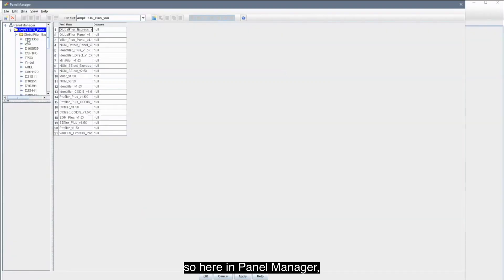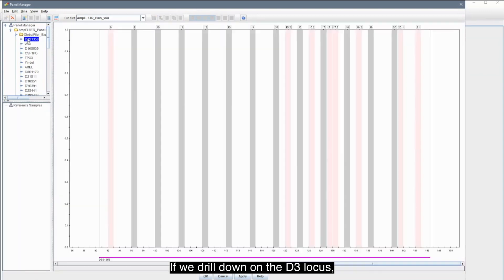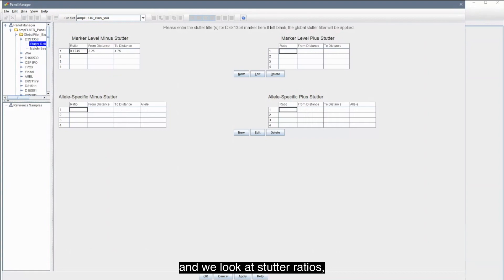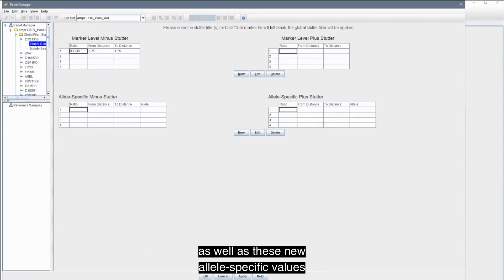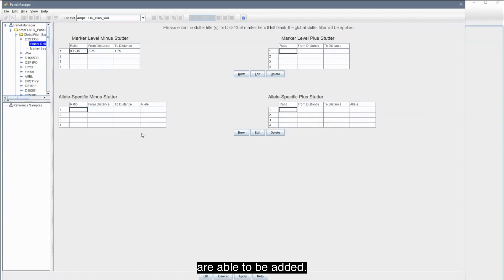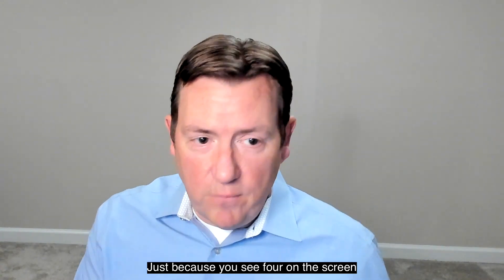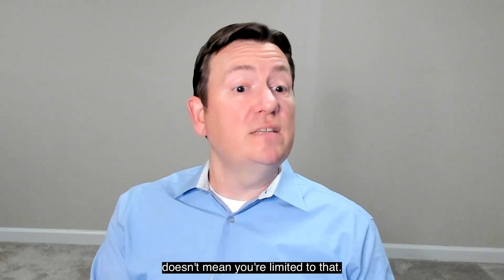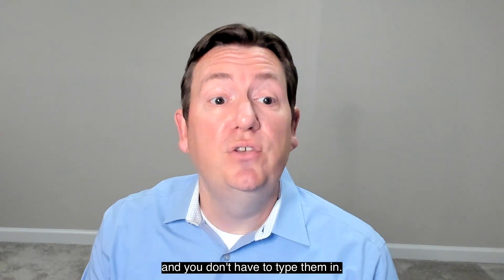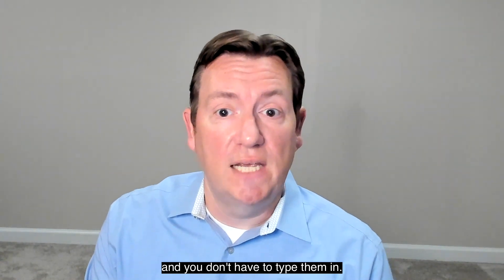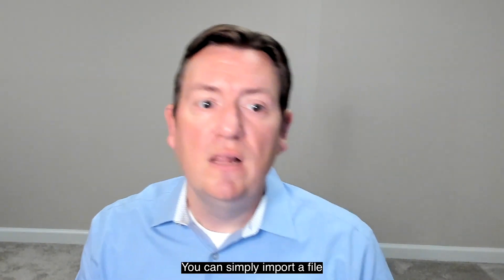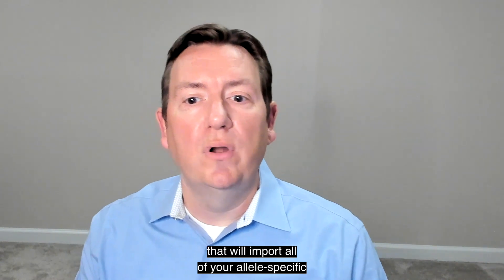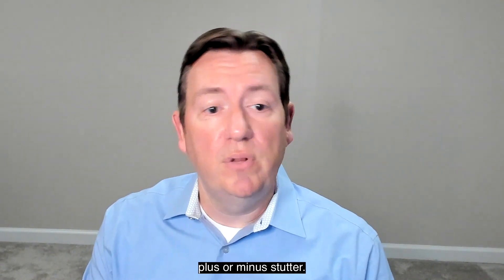So, here in Panel Manager, you notice that I've got the Global Filer Express panel open. If we drill down on the D3 locus and we look at stutter ratios, your normal expected plus and minus settings are there, as well as these new allele-specific values are able to be added. Just because you see four on the screen doesn't mean you're limited to that. You can put in any number you like and you don't have to type them in. You can simply import a file that will import all of your allele-specific plus or minus stutter.